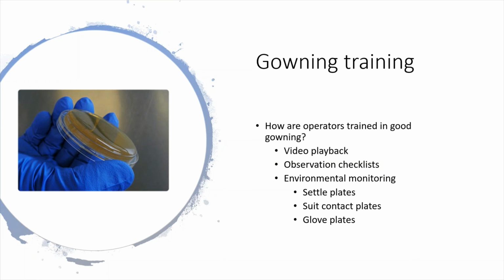Taking finger plates at the end of the process when the final gloves have been donned, and then to have exit suit plates taken as well. And this all forms valuable information about the ability of the person to gown correctly as well.